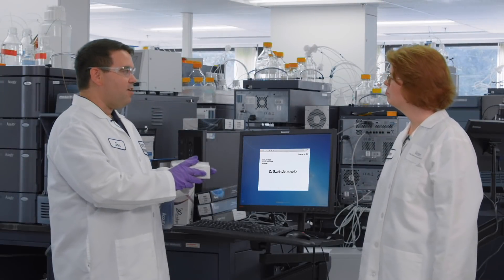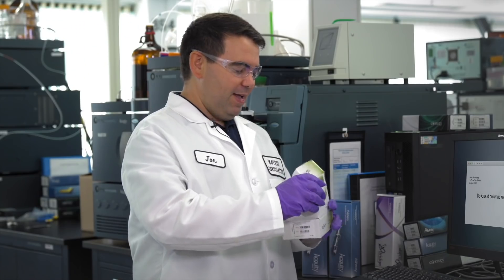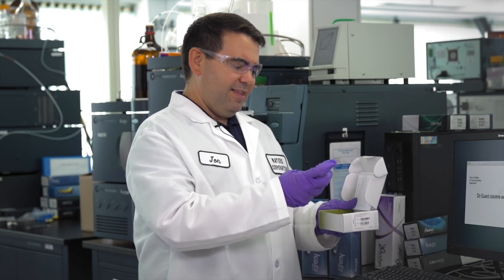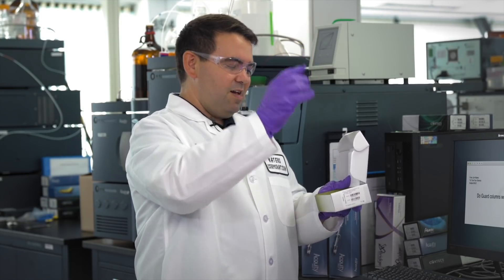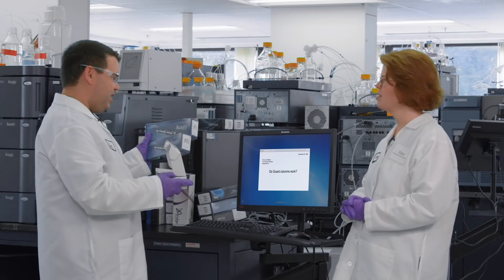So Kim, I found some guard columns — I actually borrowed them from one of the cabinets over here. When you take a peek at these, they come three in a pack, which is kind of cool. They're these little devices — kind of just like little analytical columns. I also grabbed a couple of analytical columns that we can use.